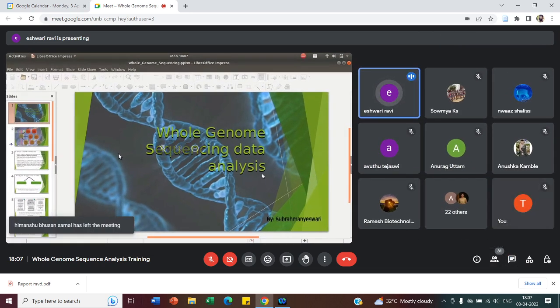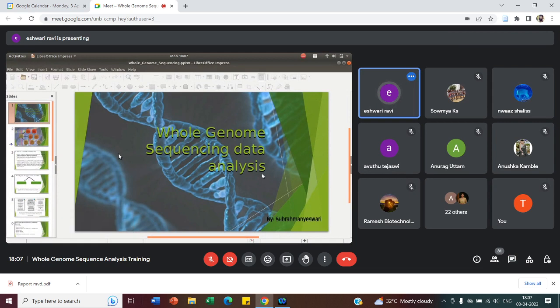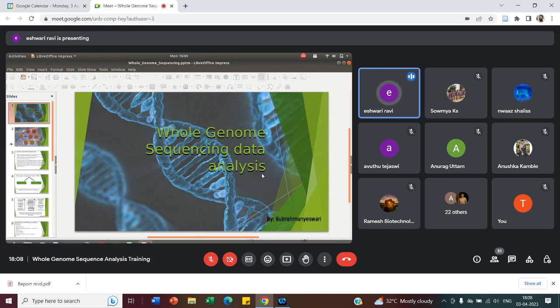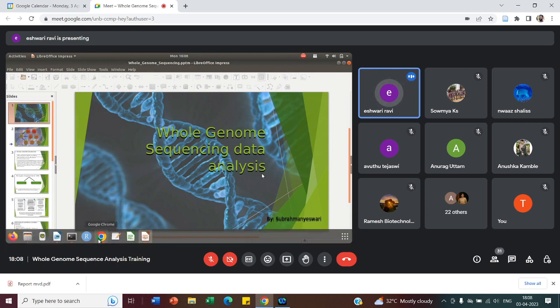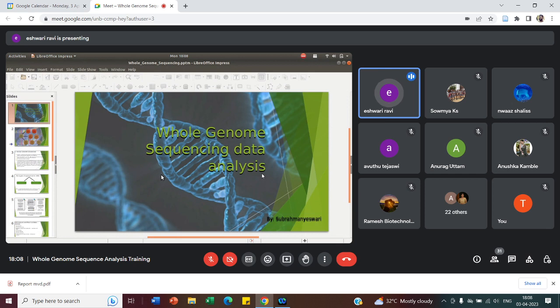As I've instructed, we will require a Linux environment system for a smooth analysis. If not, we also have a data analysis platform called Galaxy, where once you log in and register your account, you can access the tools it provides for basic analysis.